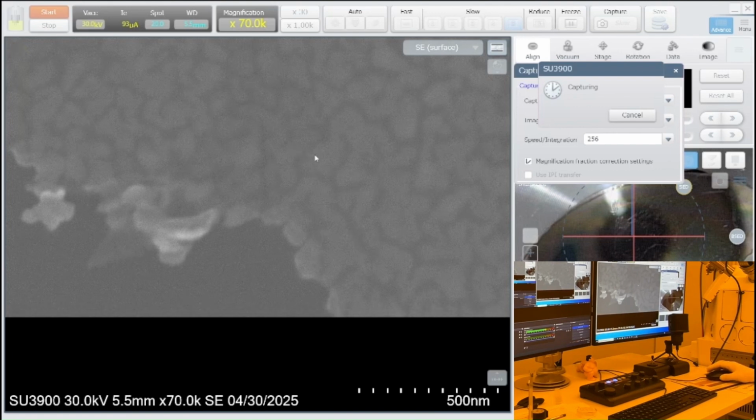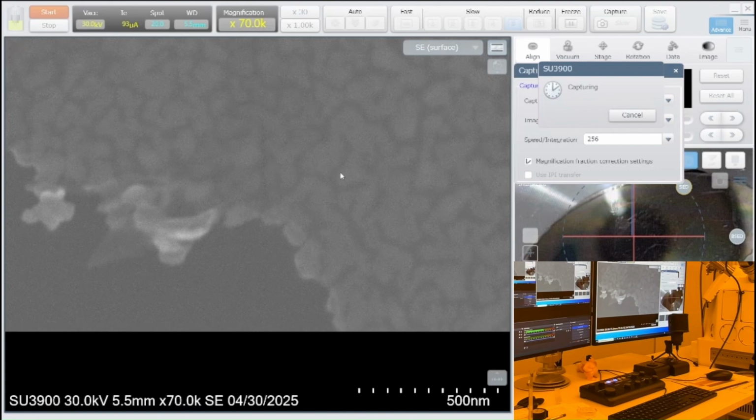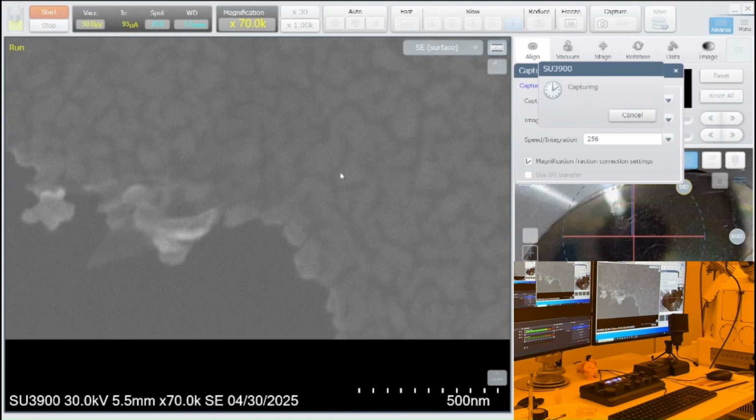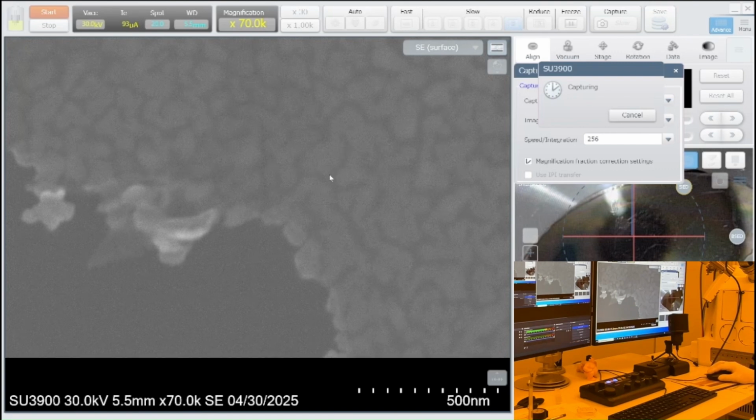So do you just want to measure these then? Is that what you're trying to do? For our experiments, we want to make sure we deposit these so that we get the largest possible grain sizes. So we have a lesser number of grain boundaries, because those grain boundaries are like lost pathways, optical lost pathways. So the fewer grain boundaries, the better for us.